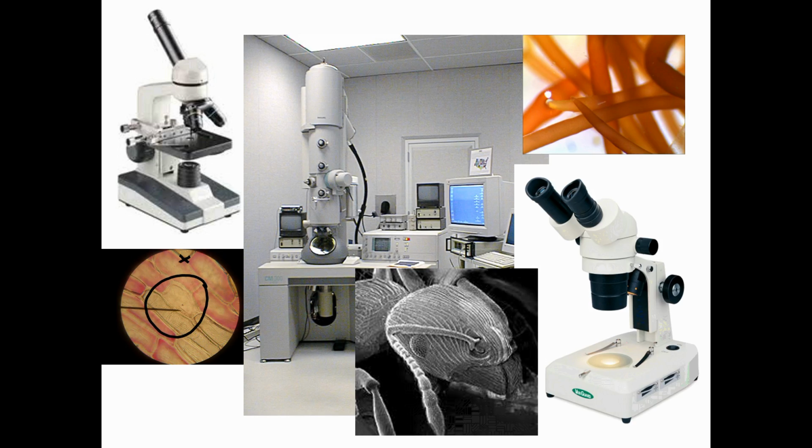But here are some microscopes. The first one in the top left is a compound microscope. Very similar to what we will use in class. Okay, right below this image, so here's a compound scope. And then this is similar to what you will see when you're looking through your compound scope in class. Okay, these are actually plant cells that you're looking at here.